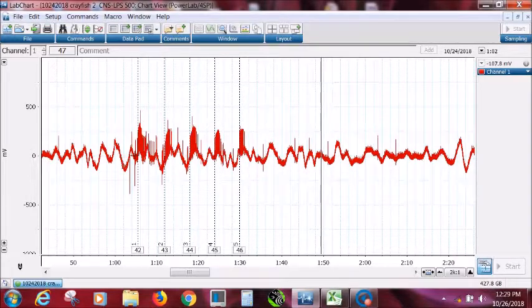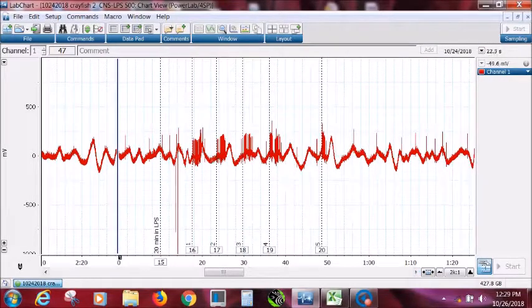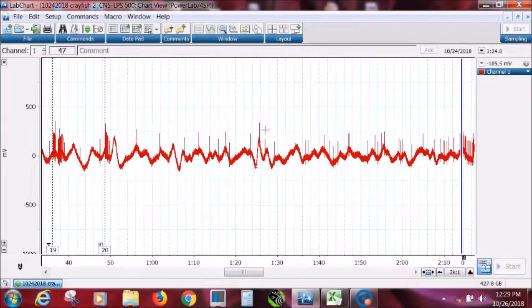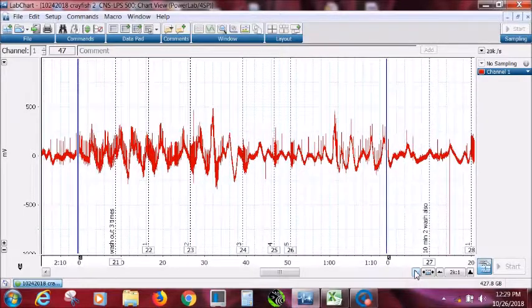Okay. We might have to send the time points when we brushed on the side of the animal for your measurements, because what we're going to do later is to measure the frequency over a set period of time, probably 2 seconds. Anyway, so here's the LPS that's sitting on for 10 minutes, and then we have another time point of 20 minutes with LPS, and you can see 1, 2, 3, 4, 5, and then there's some background activity that's going on, because as Krista mentioned earlier, there is this background activity that's just spontaneous in this preparation.